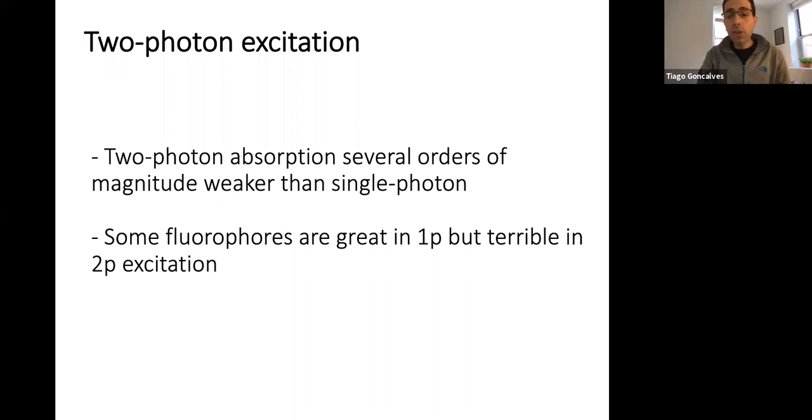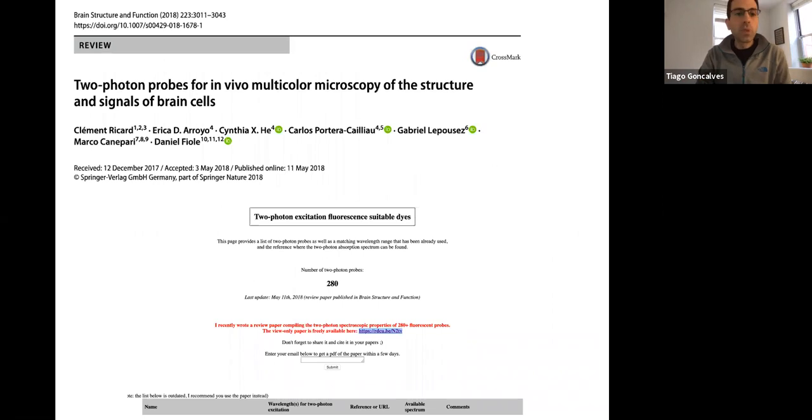And the other thing you should keep in mind is two-photon excitation is usually broader, right? Because I told you last time that you don't have a single line for exciting with two-photon, but you actually have a distribution of wavelengths. So this is something to keep in mind.